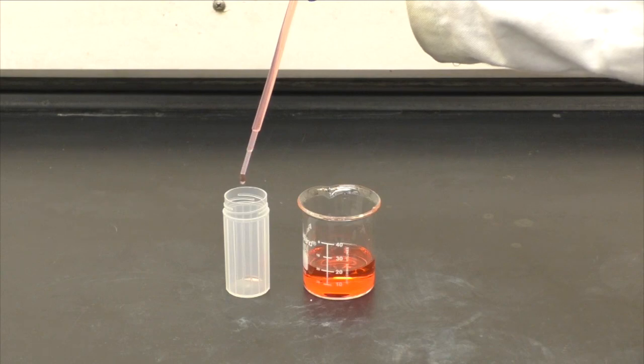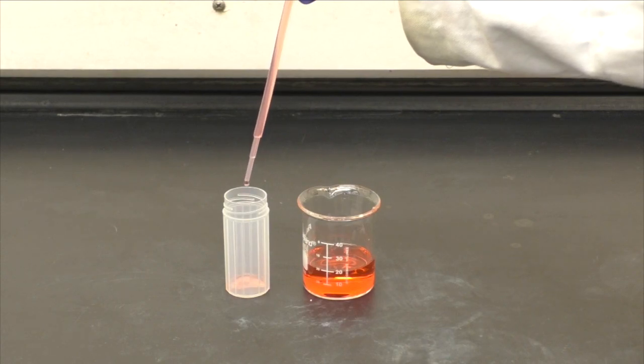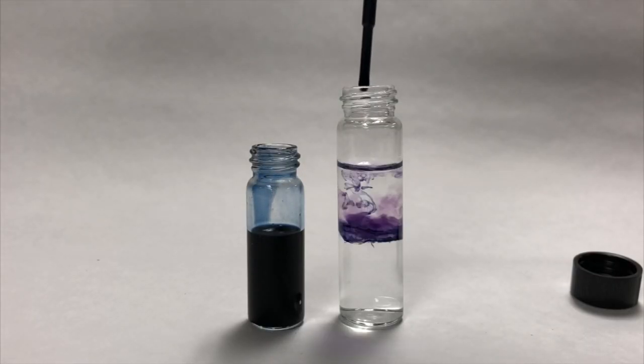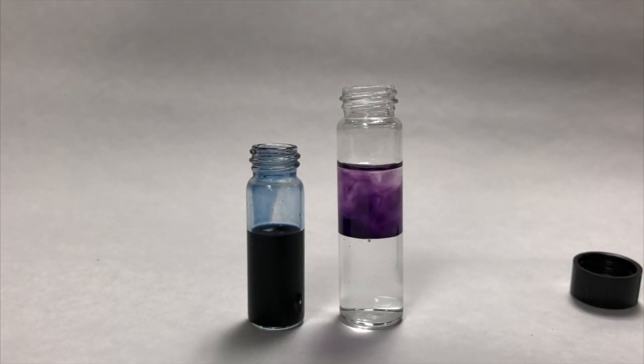So remember, to perform a qualitative test, it is important to make small, incremental changes using only small amounts of chemicals. Oftentimes, only a single drop of a liquid is needed to make a visible change.